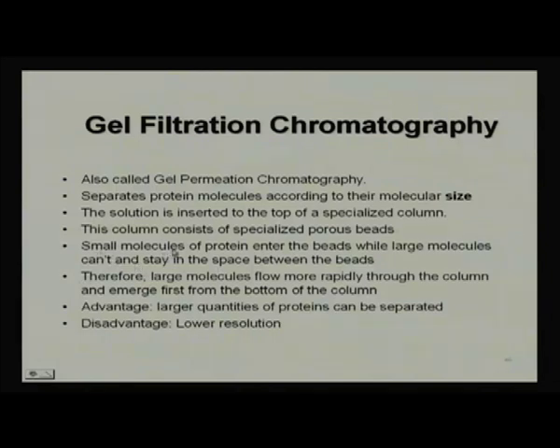So, small molecules of the protein enter the bead while the large molecules cannot and stay in the space between the beads. Therefore, large molecules flow more rapidly through the column and emerge first from the bottom of the column. What is the advantage?